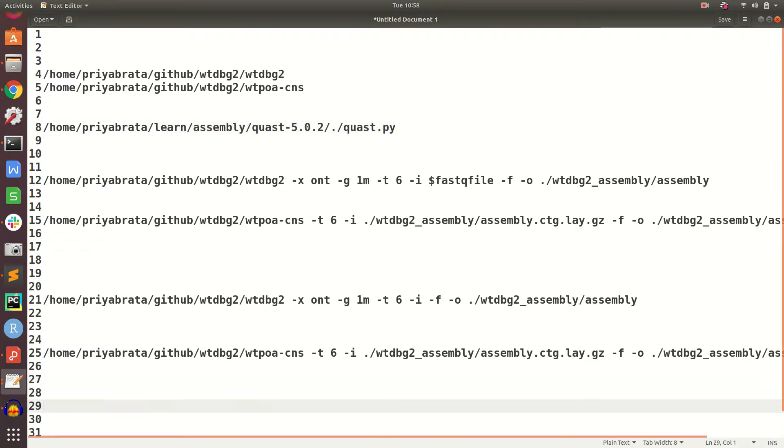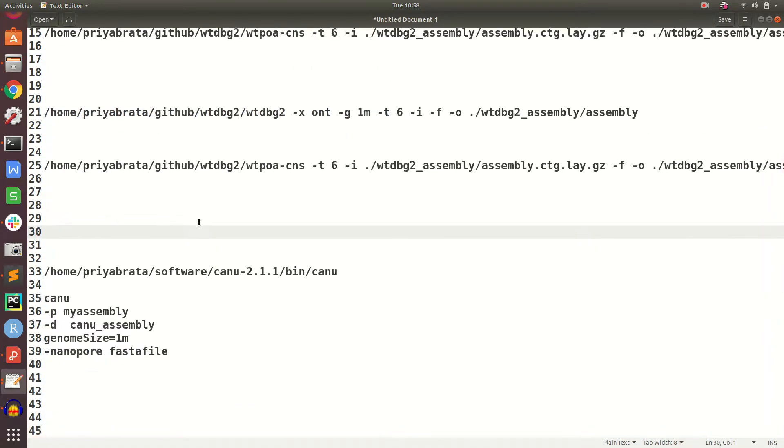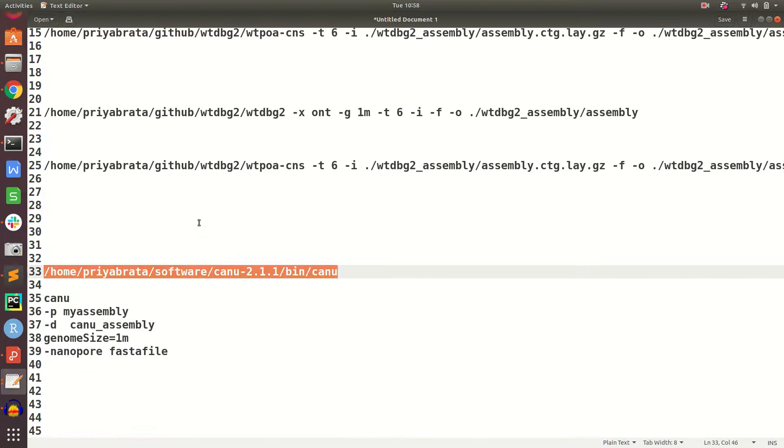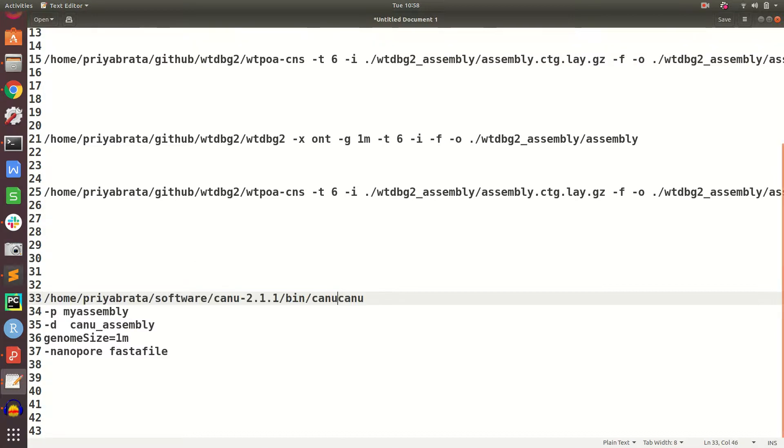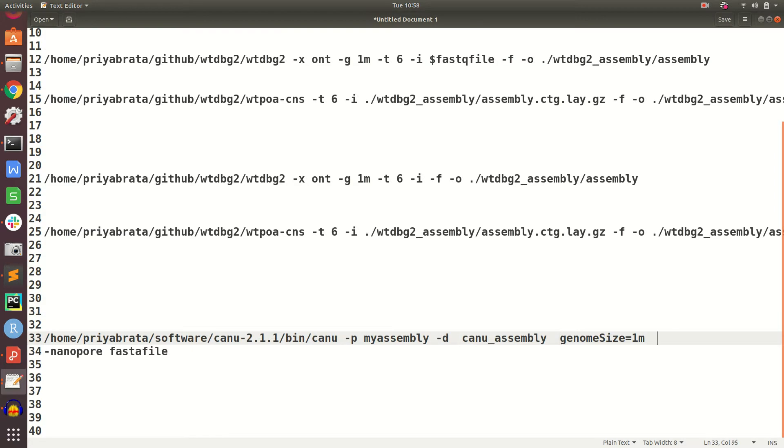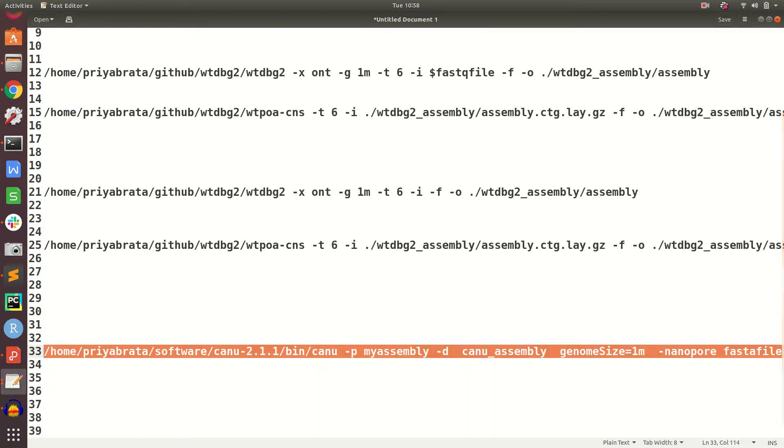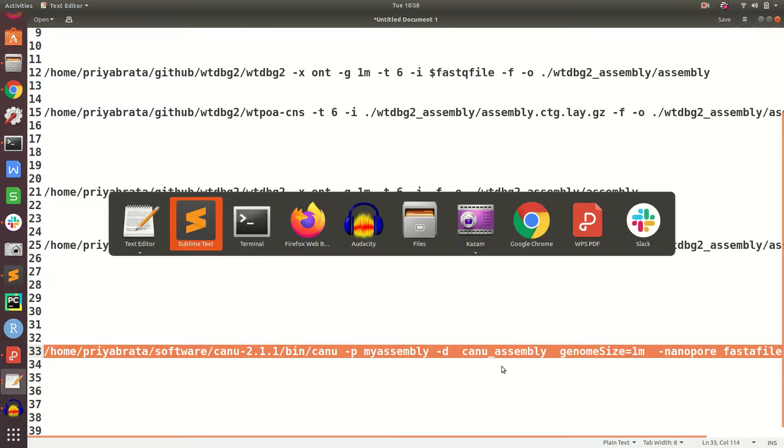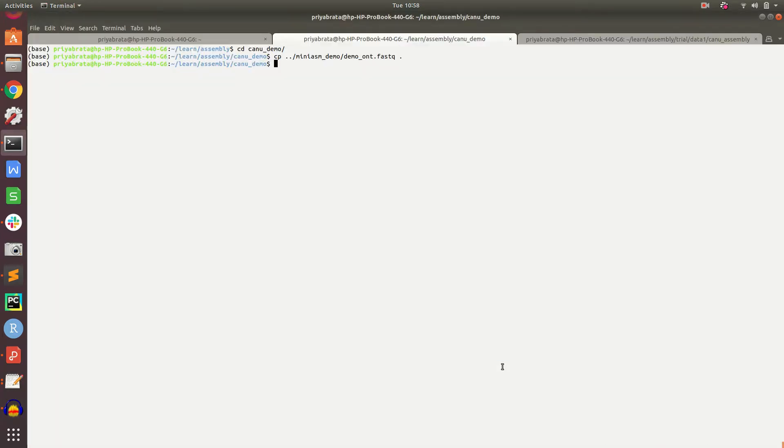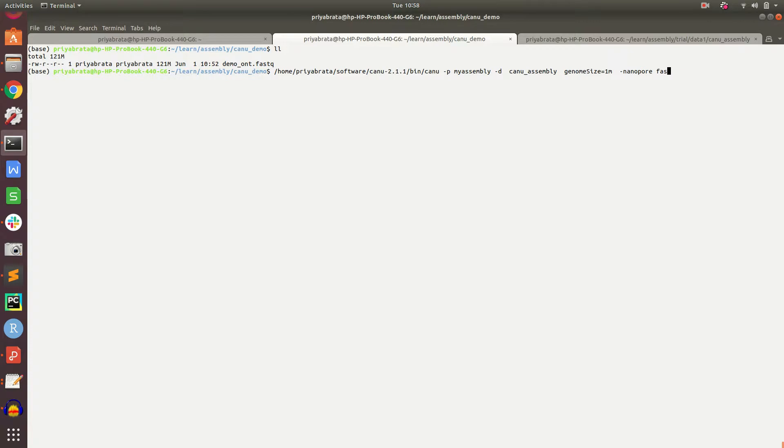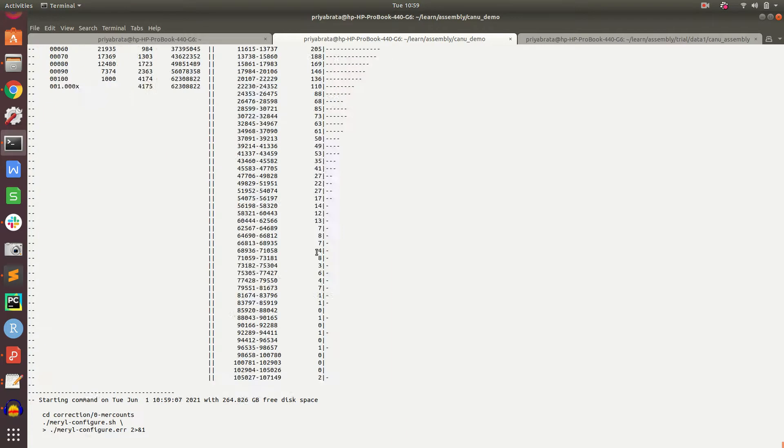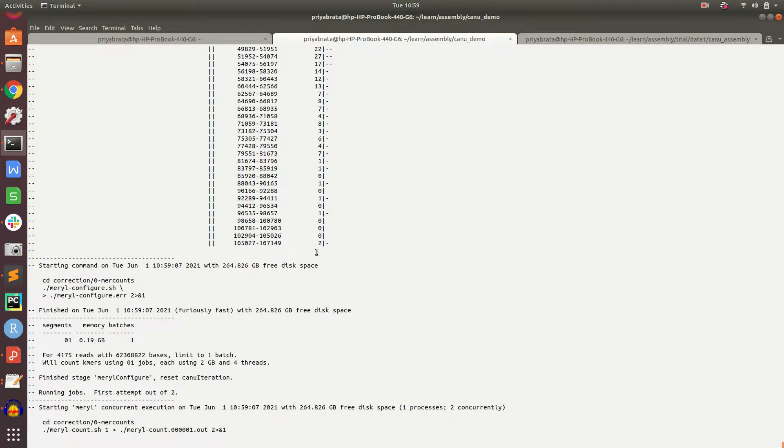Canu is installed on my PC. Let me set up the command with the demo_nt.fastq file as input. It will take some time to run, so I will pause the video and resume once it finishes.